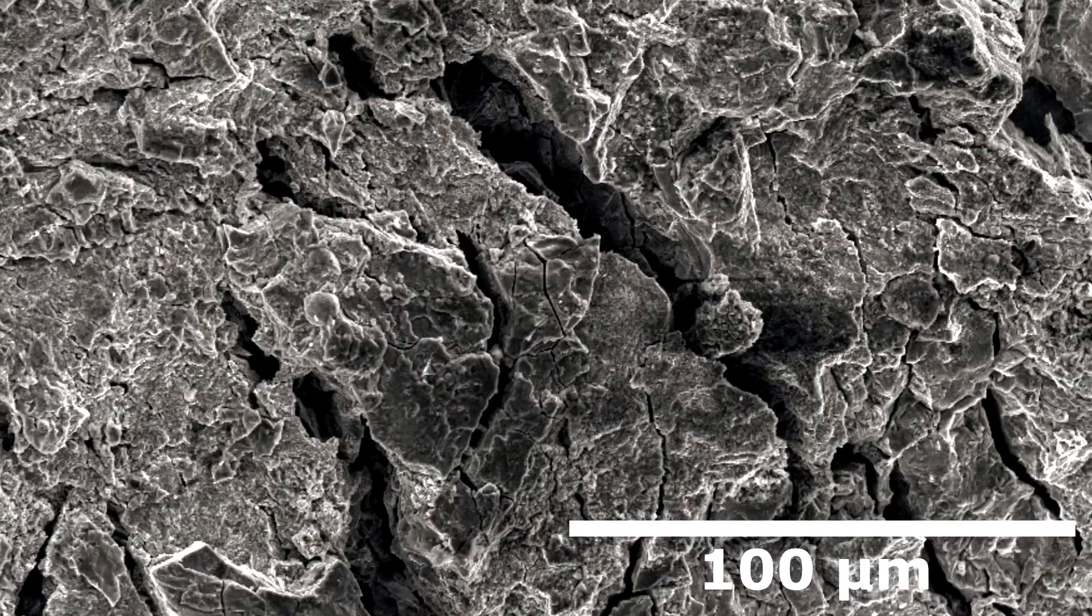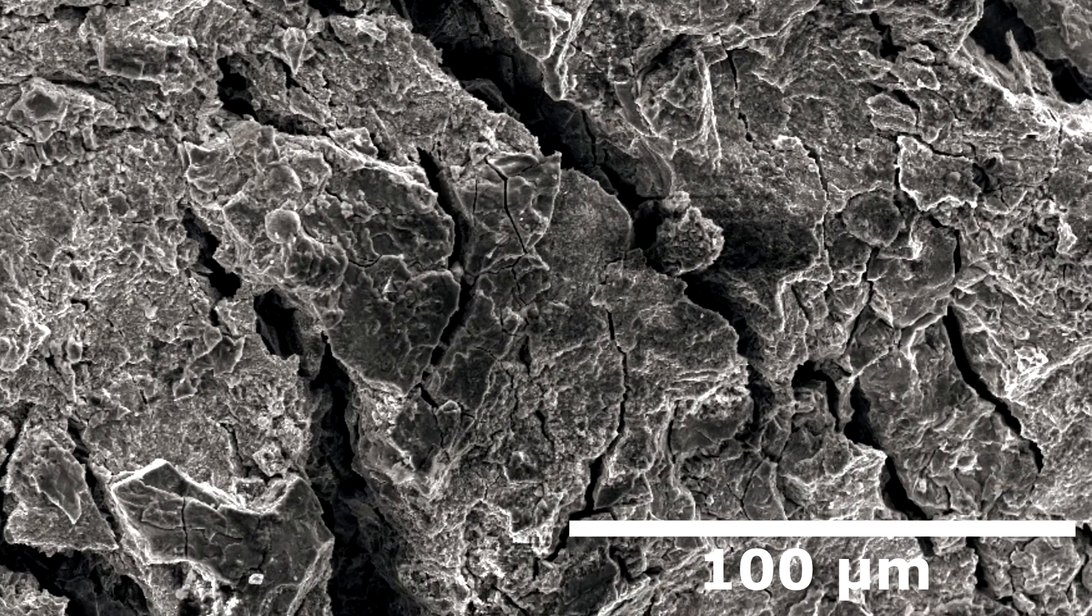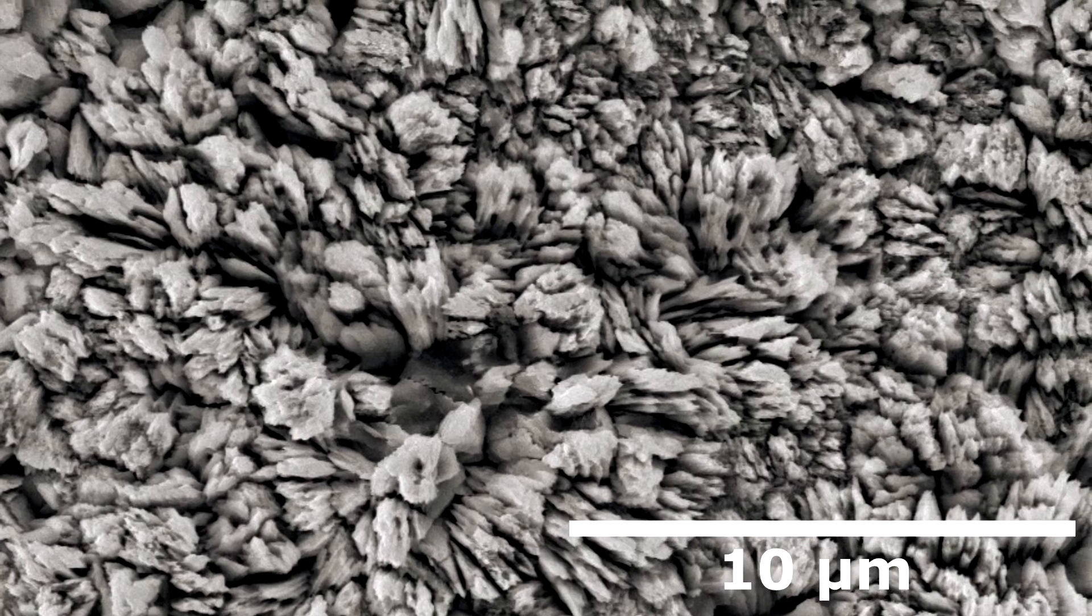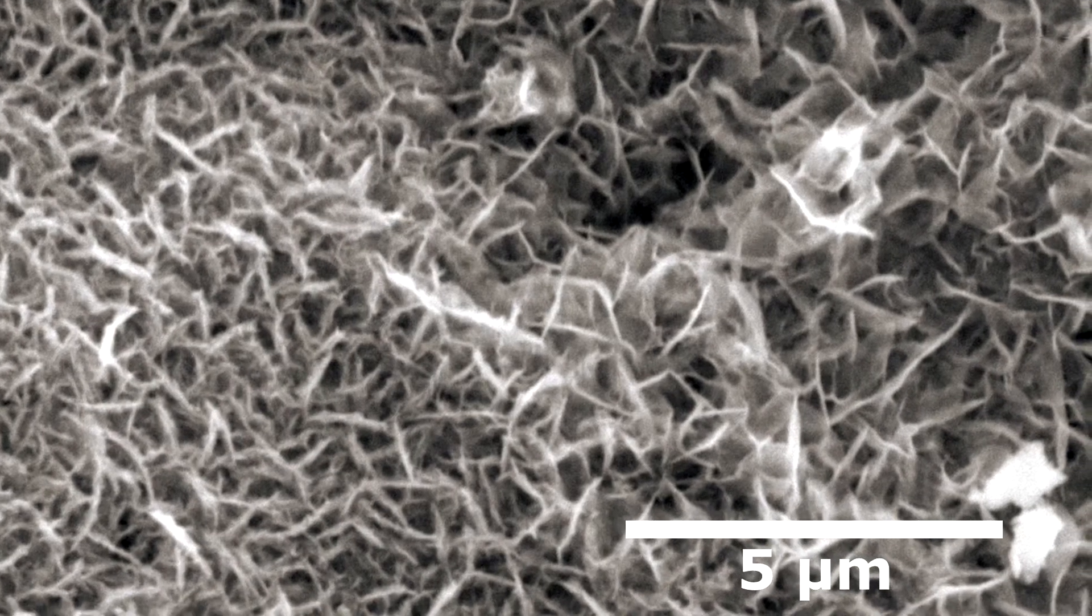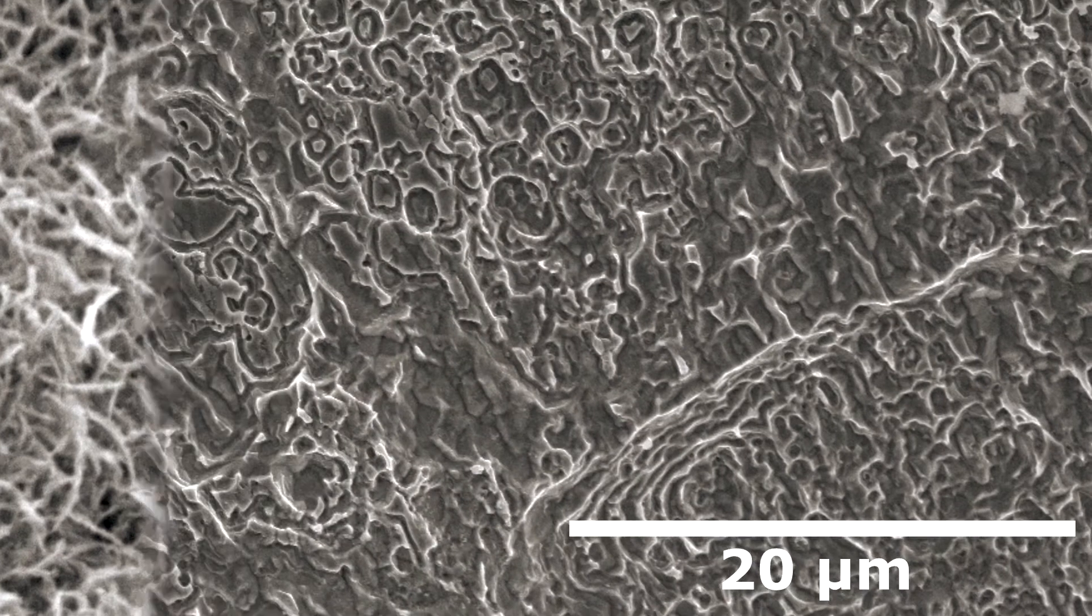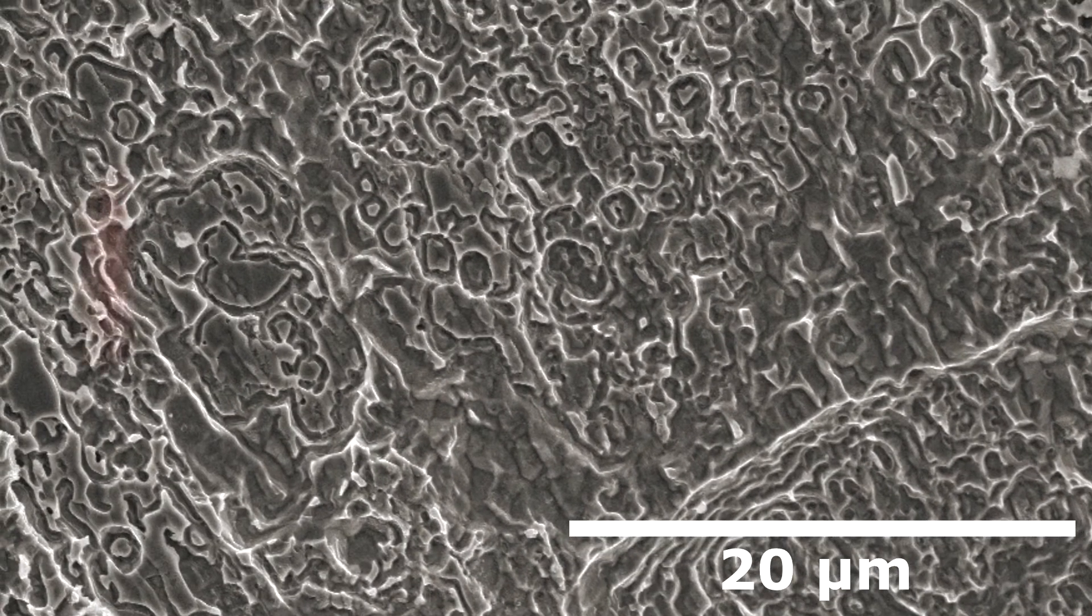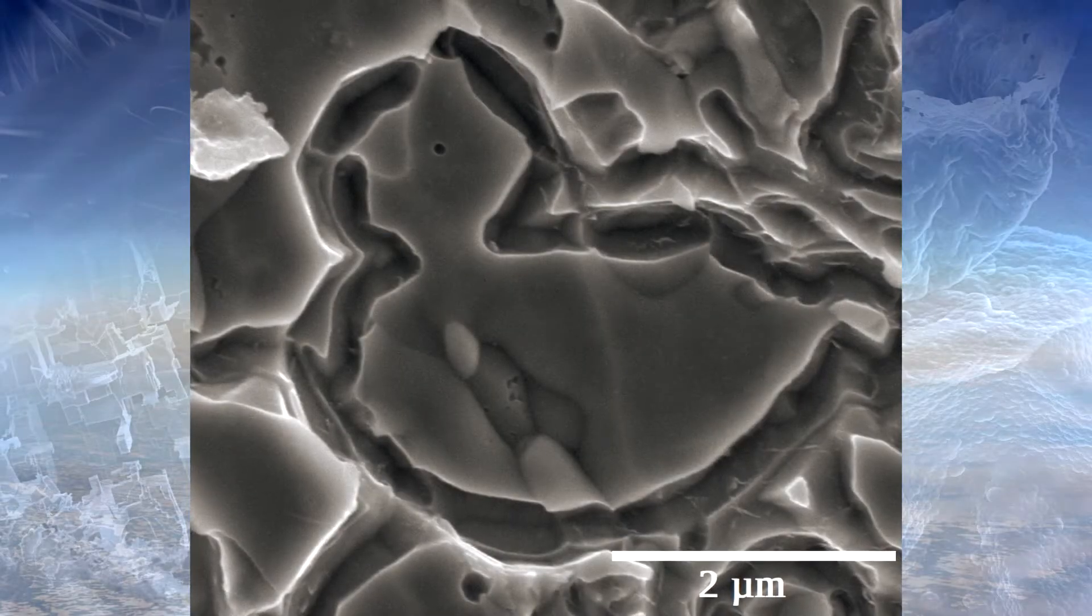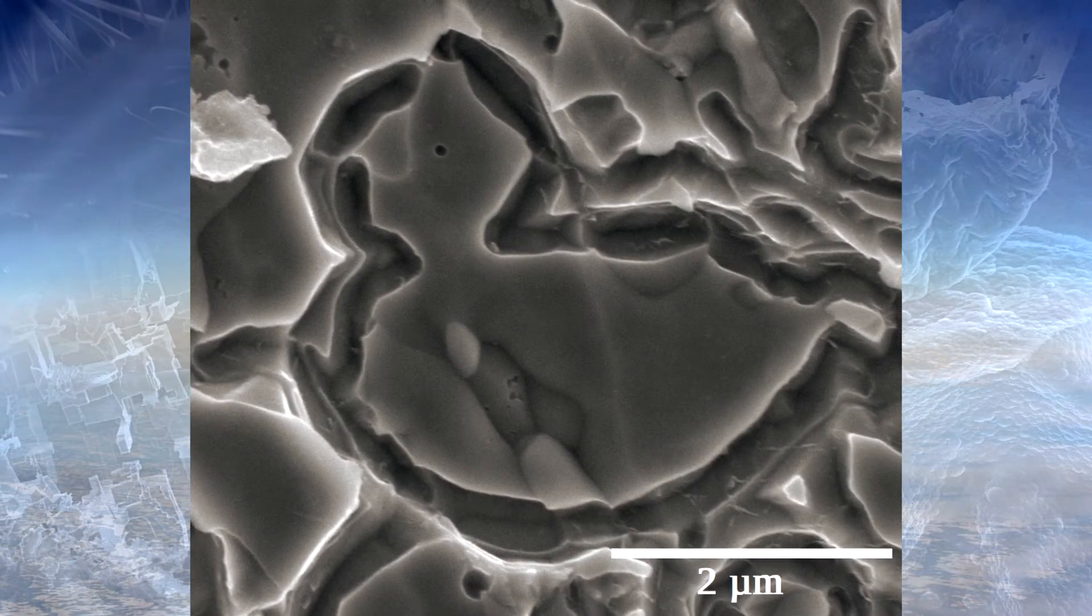There are valleys of cracks that penetrate deep into the material, but also gorgeous forests of crystals, unlike anything seen on our planet. When studying one of these sites in more detail, we found something that should not be there. This microscopic structure clearly resembles a duck.